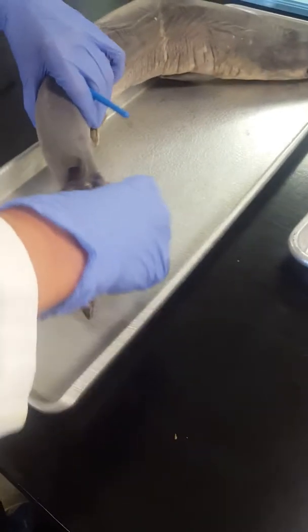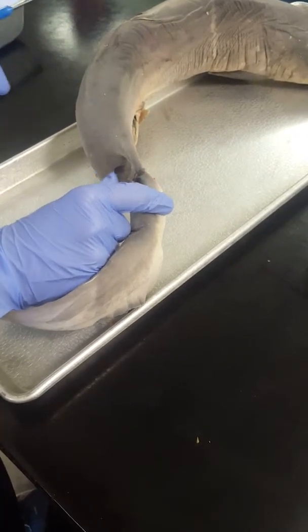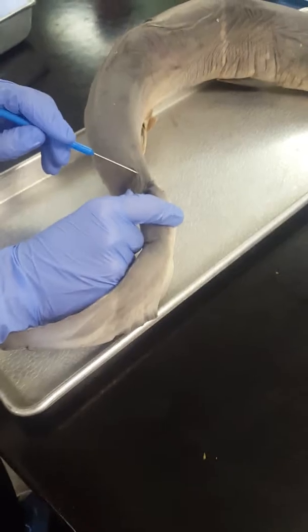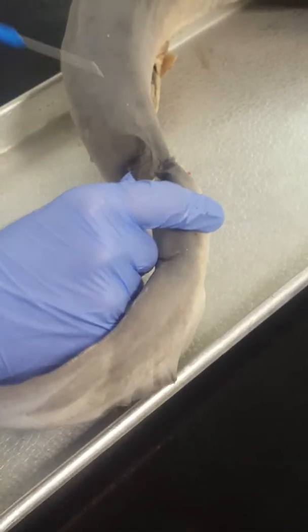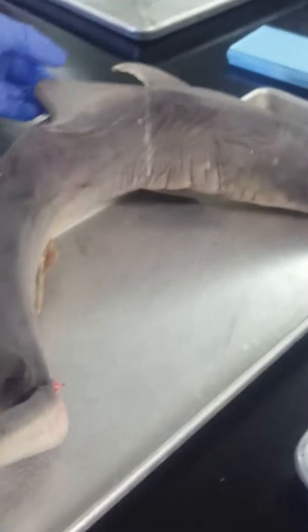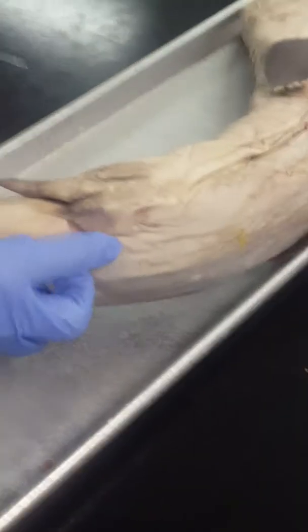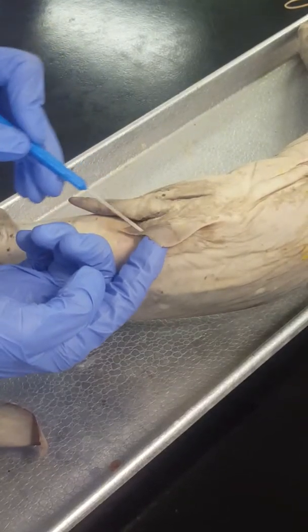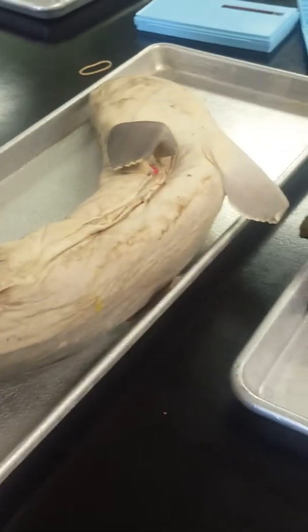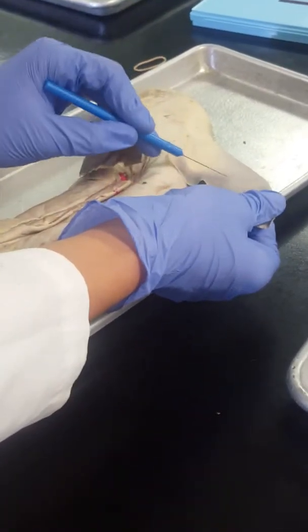Posterior dorsal fin is this small fin right where the tail splits. Gill splits. Anterior dorsal fin is the big fin on top. Pelvic fin is this fin here. Pectoral fin is this fin out here.